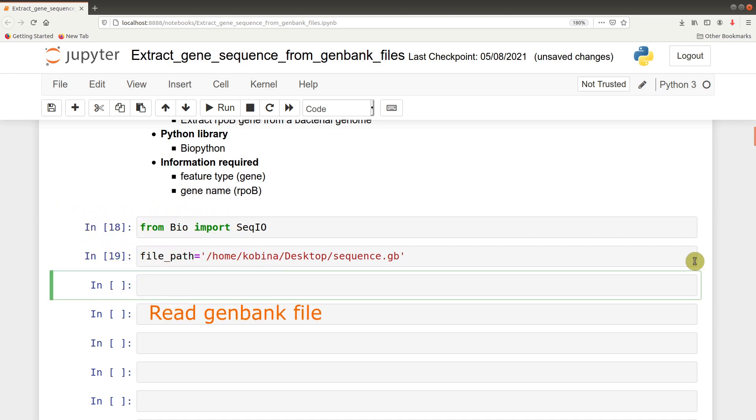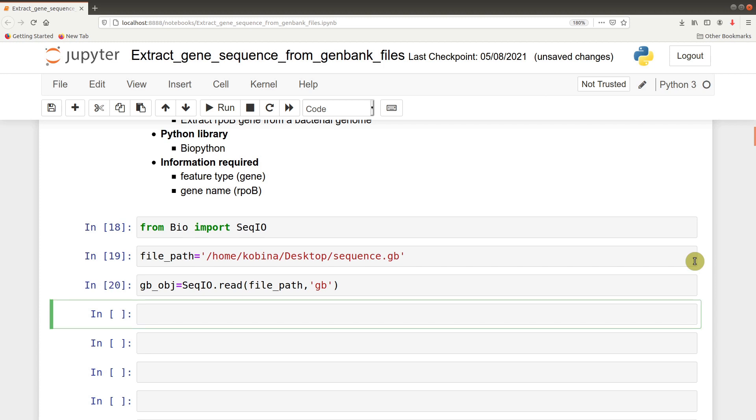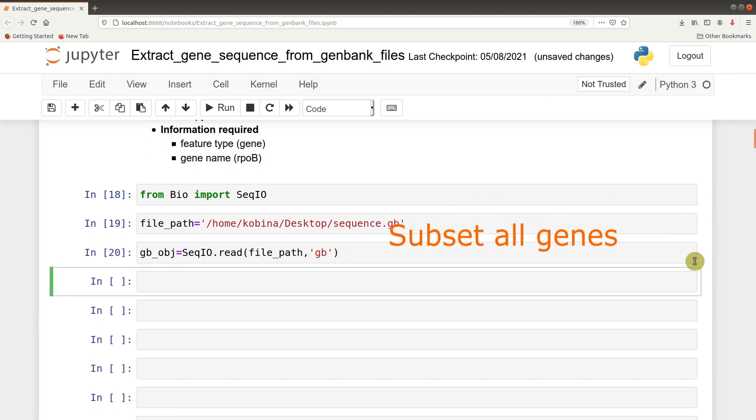After setting the file path, we now open the GenBank file and assign that operation to a variable. In this case, the variable becomes gbobj, that's GenBank object. So we say SeqIO.read file path, then we give the format. So we now read it.